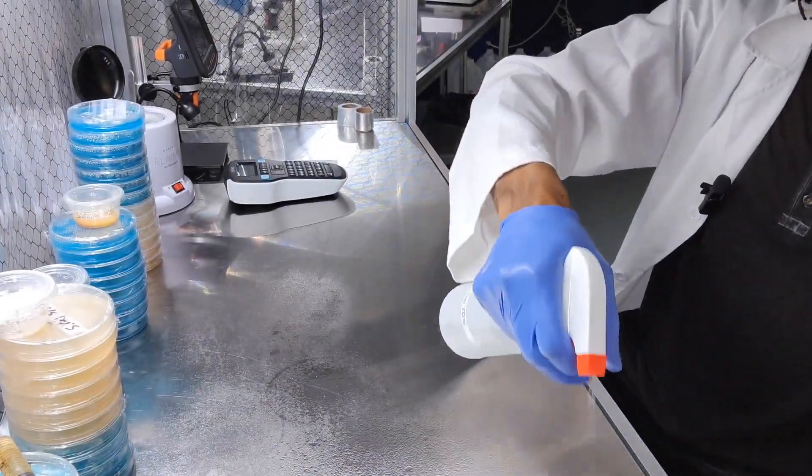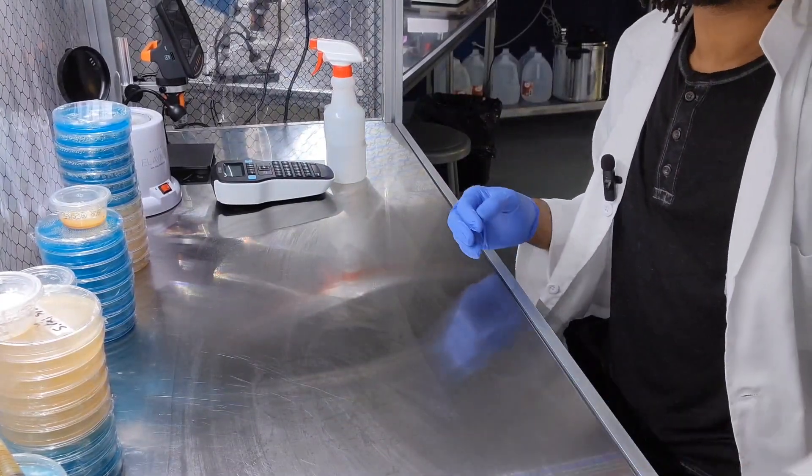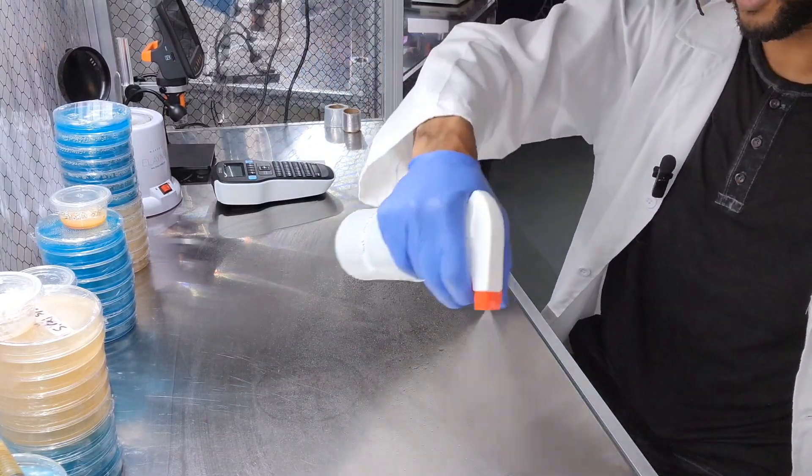So last time we inoculated a few plates, and we also did some secret plates in the background just to surprise you guys today because they're pretty cool. I can see just from looking over at the table that they came out pretty good. So let's go dive into the flow hood. I'm going to grab some isopropyl — 70% — I like to spray again just for good measure.